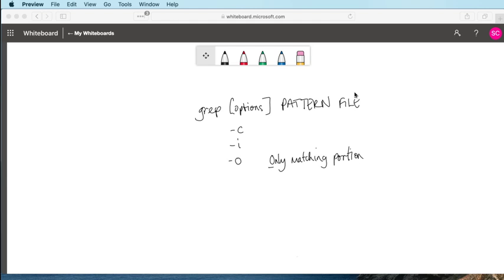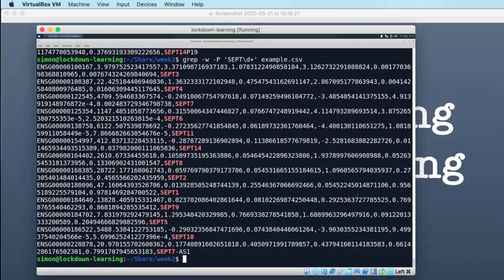-w we've just covered. So -w will only give you lines containing matches that form whole words, and what we need to know in order to figure out whether this works for our use case or not is what constitutes the boundary of a word, what constitutes the beginning and end of a word according to grep. And I'm guessing, but I think the man page will probably tell us. So let's see if it does.